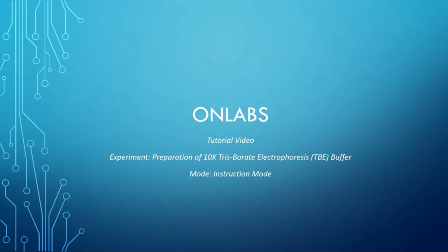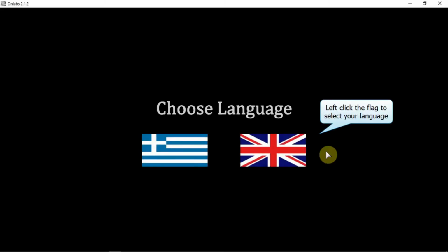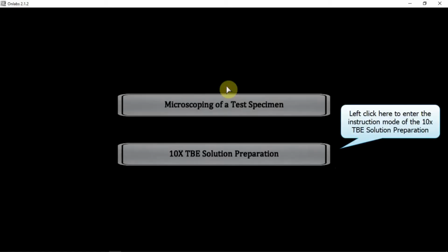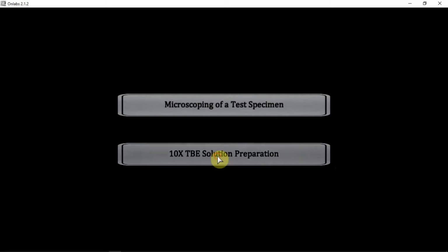This video presents the preparation of 10x Tris borate electrophoresis buffer within the virtual environment of the Onlabs application using the instruction mode. Select your language. Click on the first button to select the instruction mode. Click on the second button to enter the instruction mode of the application's virtual environment. Follow the on-screen instructions to complete the experiment.